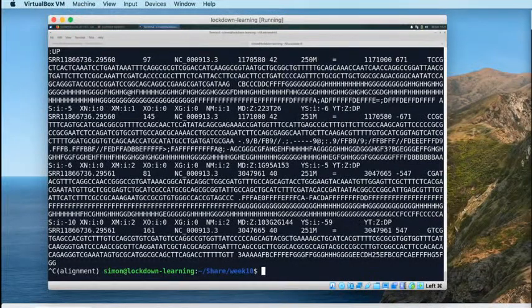You could check the header. You could check the first few reads. You could check the last few reads. You could write it back out to a SAM file and use a tool called diff, although that's quite a long and involved thing to do. You could even write it back out and calculate the MD5 sum and compare it to the SAM file.